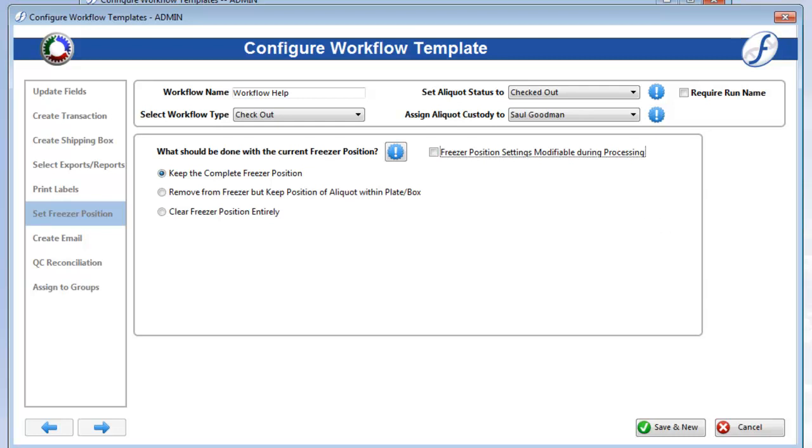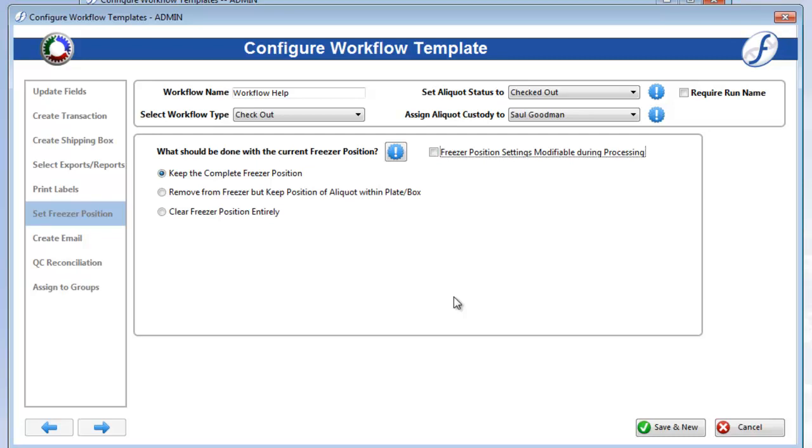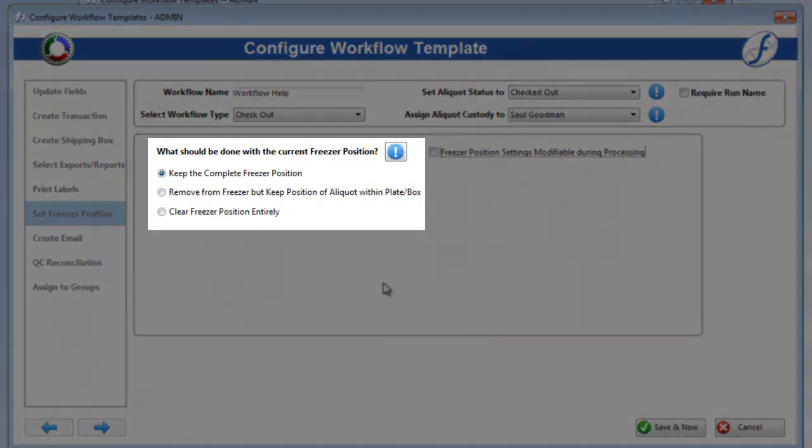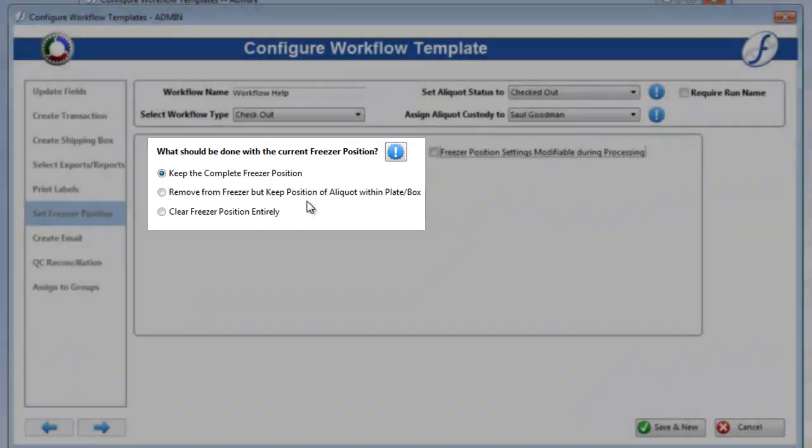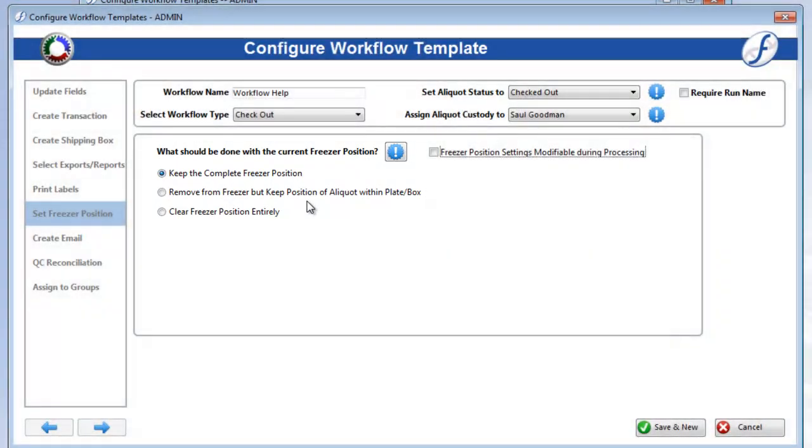The Set Freezer Position page will vary depending on the type of workflow you select. Checkout and Process Shipment Workflows have these three options: Keep the Complete Freezer Position, Remove from Freezer but Keep Position of Aliquot Within Plate Slash Box, and Clear Freezer Position Entirely.